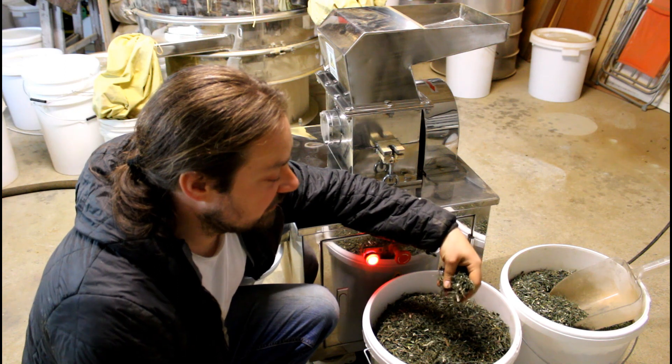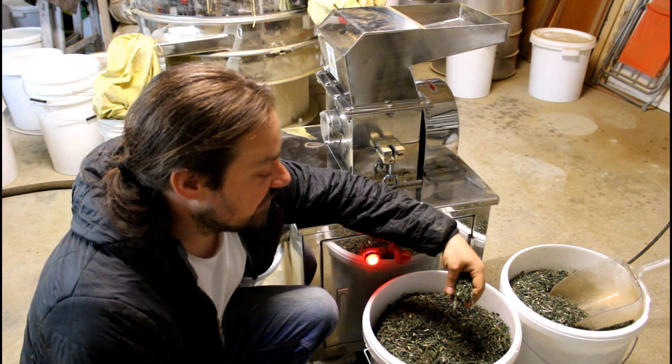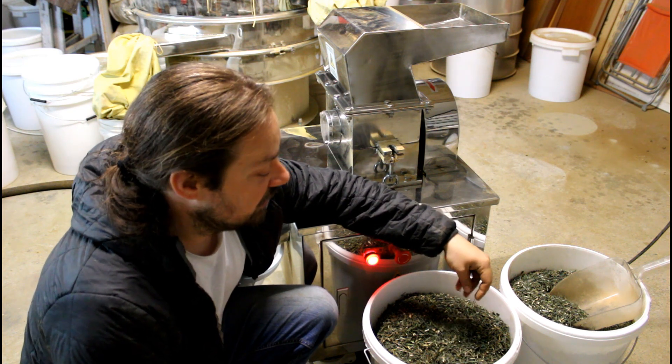To have a finer particulate. And this finer particulate has an increased surface area. Which basically makes the extraction faster.